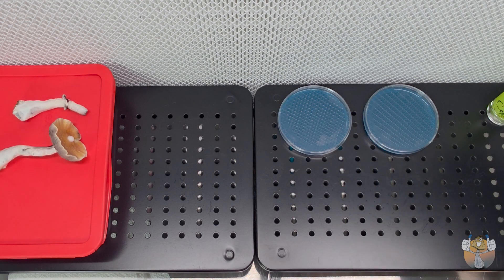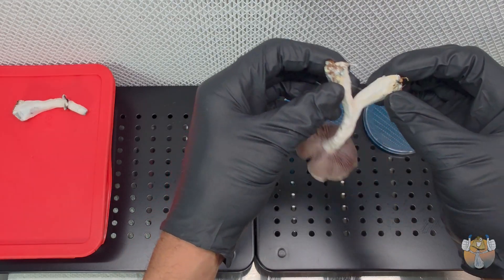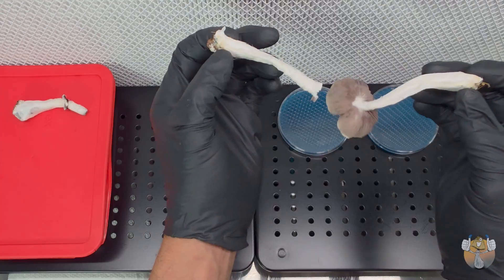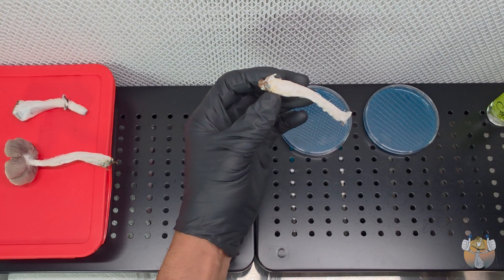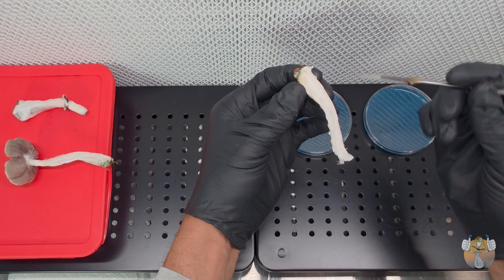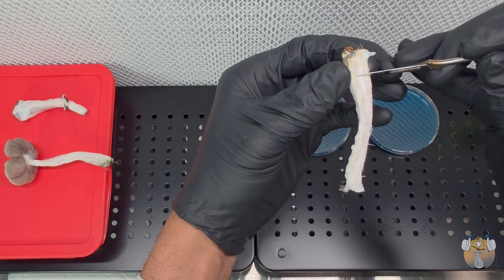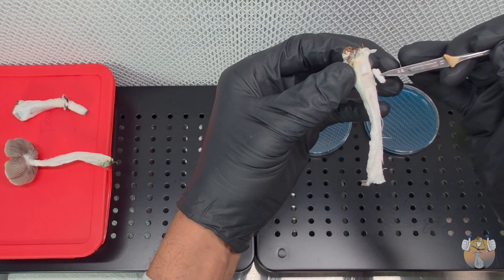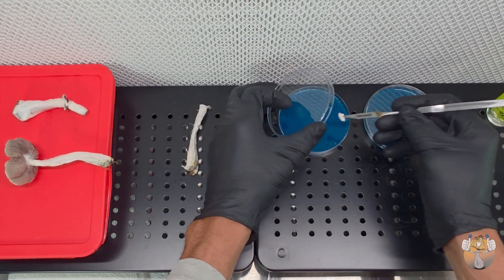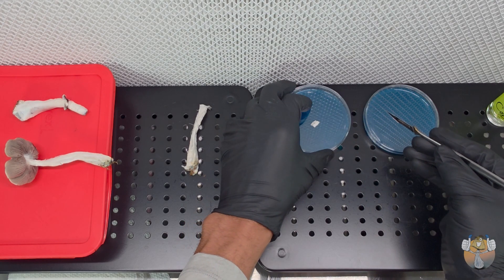Alright Shroomies and Shroomettes, we are finally able to clone the prettiest fruit out of the bunch. What you want to do is crack that thing right down the middle just like this. The reason why we clone is because we want to try to recreate this look in future genetics down the line, and cloning is the best way to do that. Grab your sterile blade, cut a small section out of the middle of the stipe, and transfer that right onto our agar dish. Quick and easy — takes very little time but it's very effective.